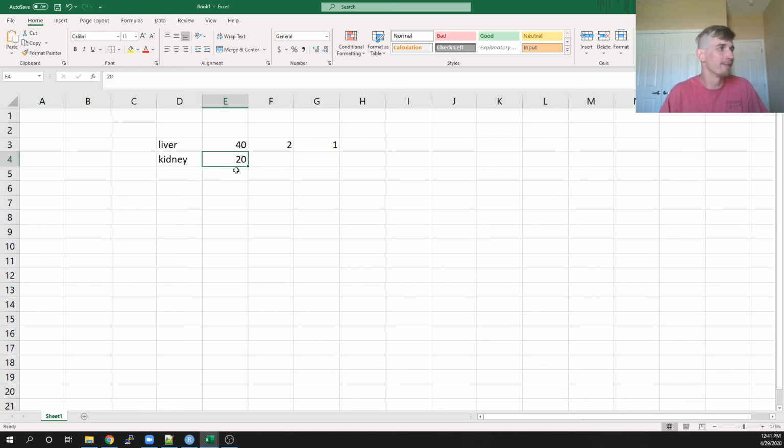We look for our fold change in gene expression. And so we'll see this log fold change come out over and over again, because we're actually going to plot it out here in a second. But what I should point out is that if in our result we see a log fold change of greater than 0, it means that expression is going to be biased towards the liver. But if it's less than 0, expression would be biased towards the kidney. That's kind of what's going to happen.